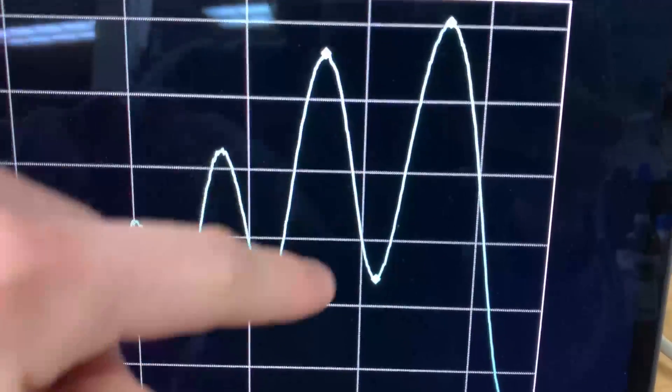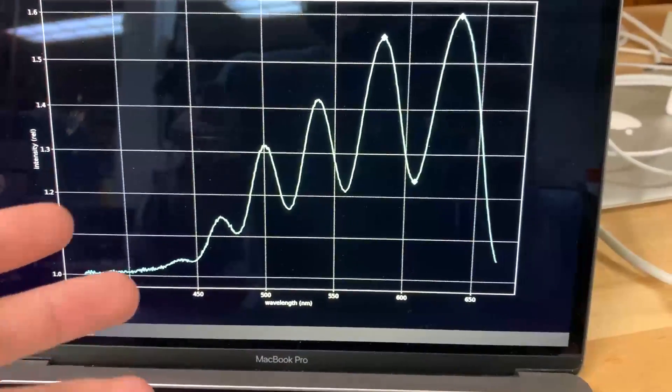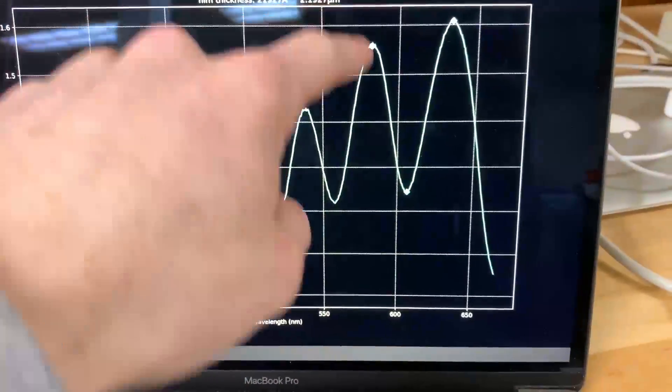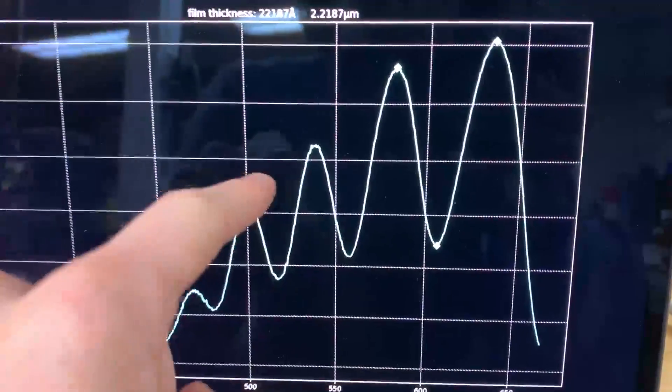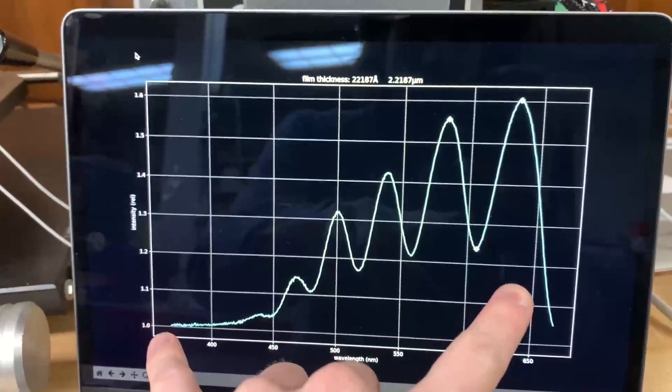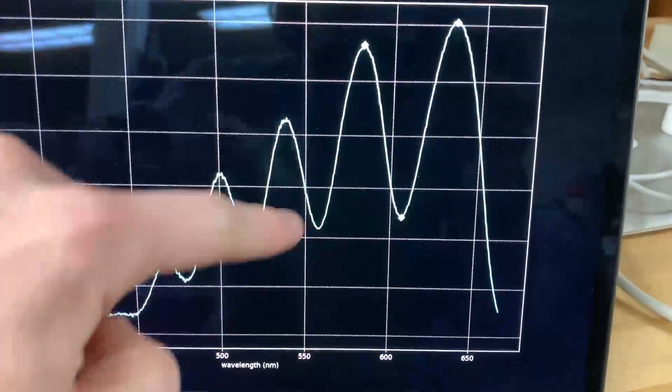If we have some python script or whatever that finds the period of this, you can take these little markers and that can be done really simply. We just have some input I'm taking the derivative of it in the software and then wherever the derivative crosses zero we have like a maximum or minimum. The more of these markers you have you can kind of average your measurement over a longer field and get more accurate measurements.